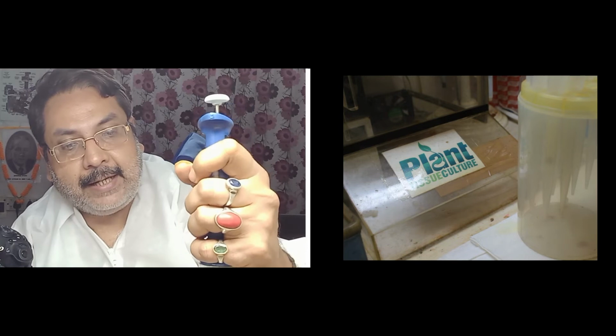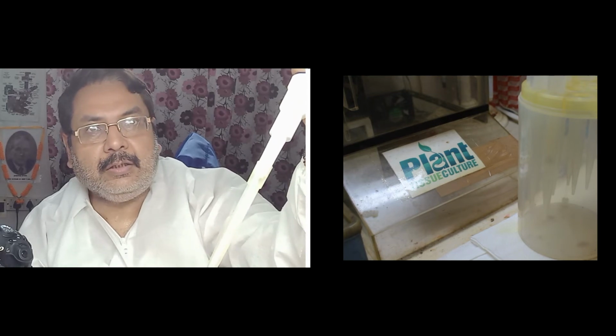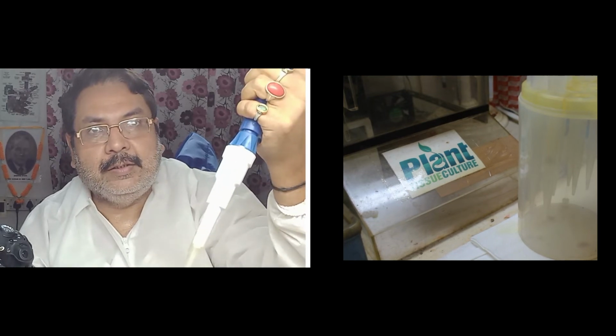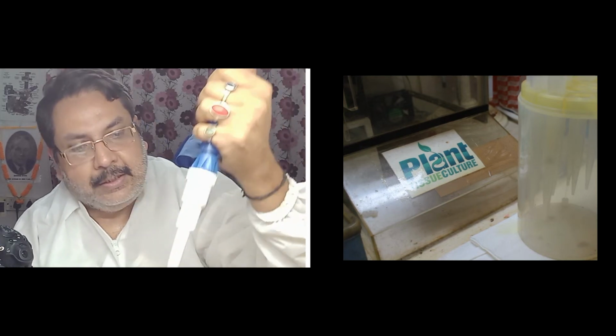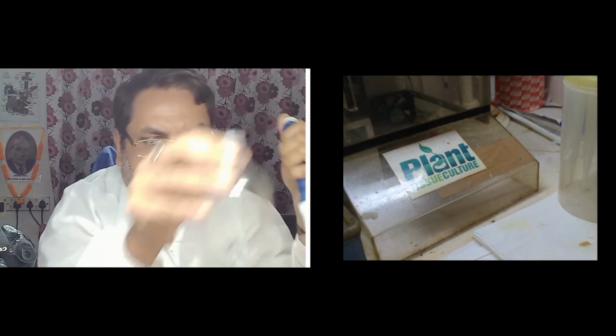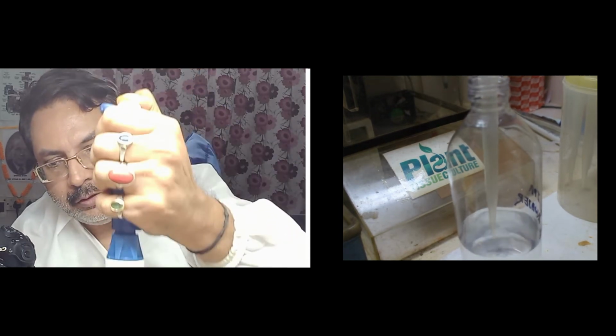This is an auto pipette, and the tip is very big. When you put the tip inside, this is the tip, and here is the tip. So this is a very big one. This is used to transfer big amounts of solutions. It works in the same way, same auto pipette. Just the volume is different. Just push the plunger as before, put it inside, and take the liquid.